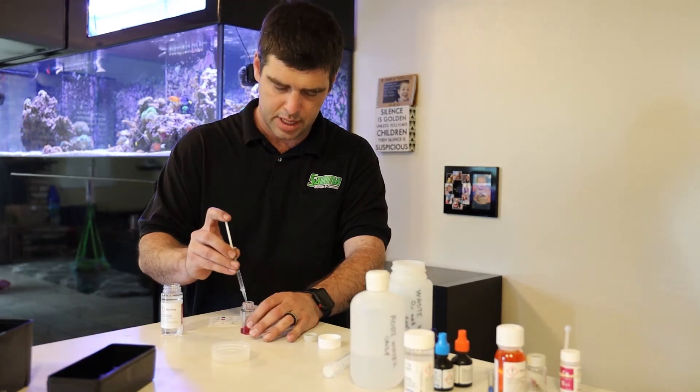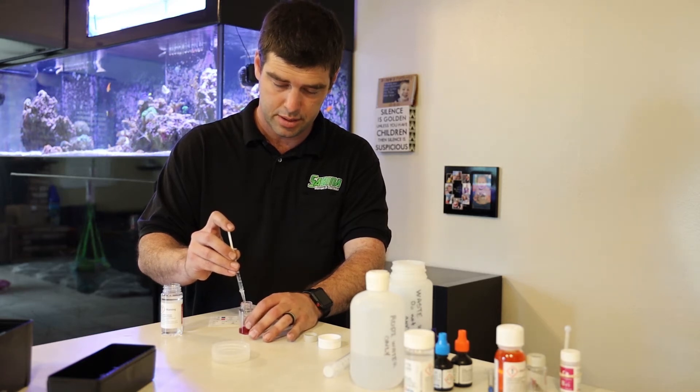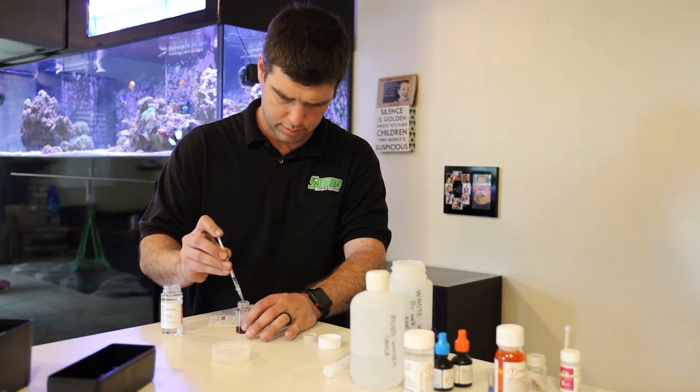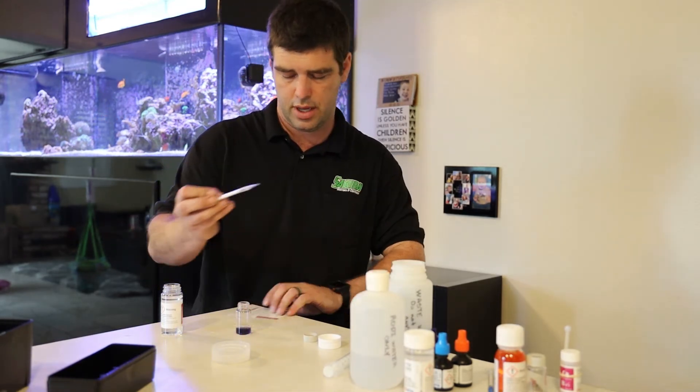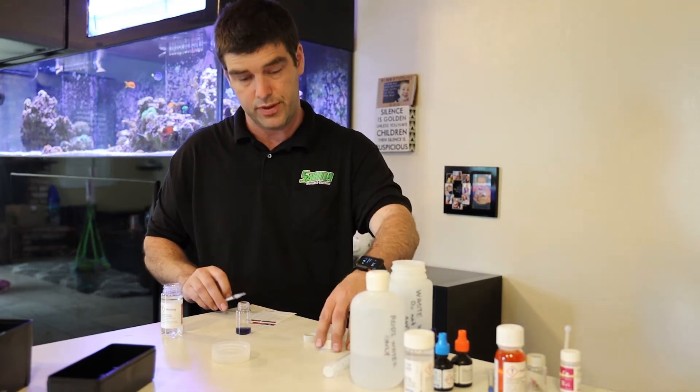Exact same as the other two tests — we're using one milliliter to titrate. 0.25, which turns into 7.5, which is 1500.